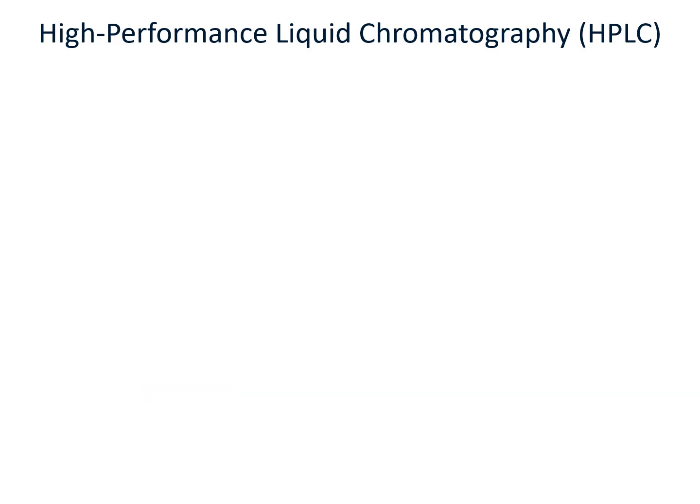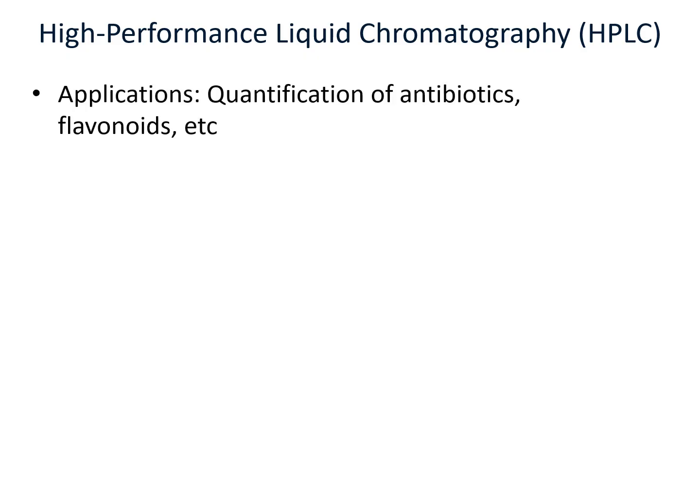Now, HPLC has several applications such as quantification of antibiotics, quantification of phytochemicals from plants, and so on.